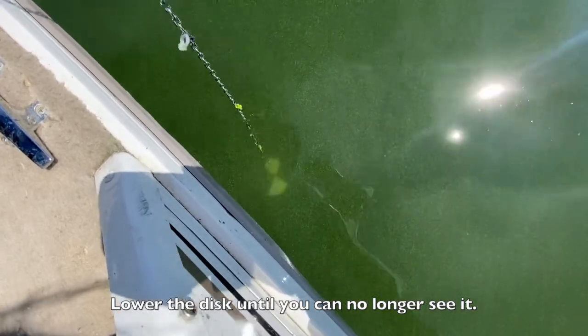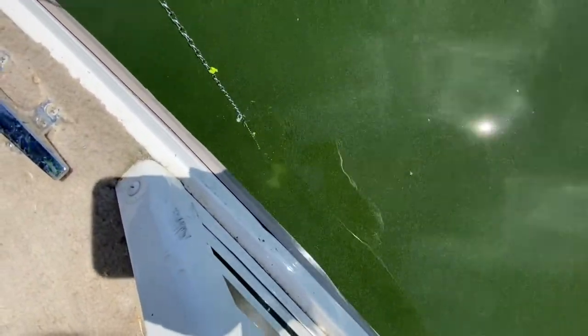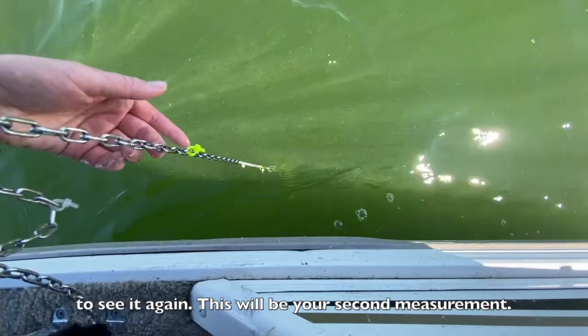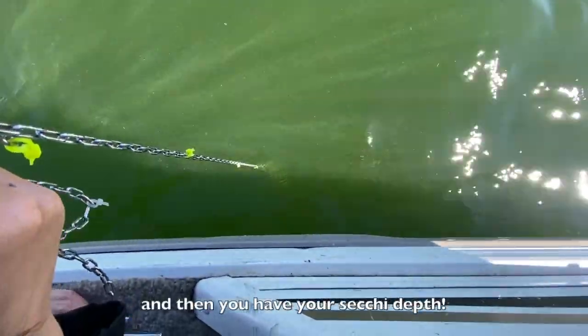Lower the disc until you can no longer see it — this will be your first measurement. Slowly raise the disc until you are just able to see it again — this will be your second measurement. Take the average of these two measurements, and then you have your Secchi depth.